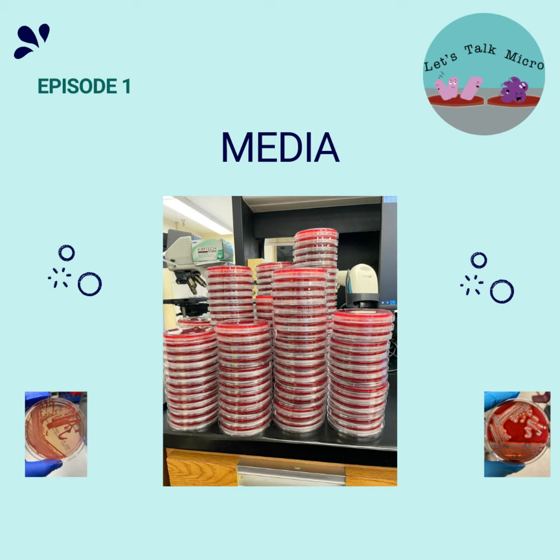Neisseria do not grow on it. Anaerobes do not grow on it. Haemophilus does not grow on it. Pasteurella doesn't grow on it, with the exception of P. aerogenes. So not all gram-negative rods grow on it either. So it is selective for gram-negative rods, and then it's differential for lactose fermentation.